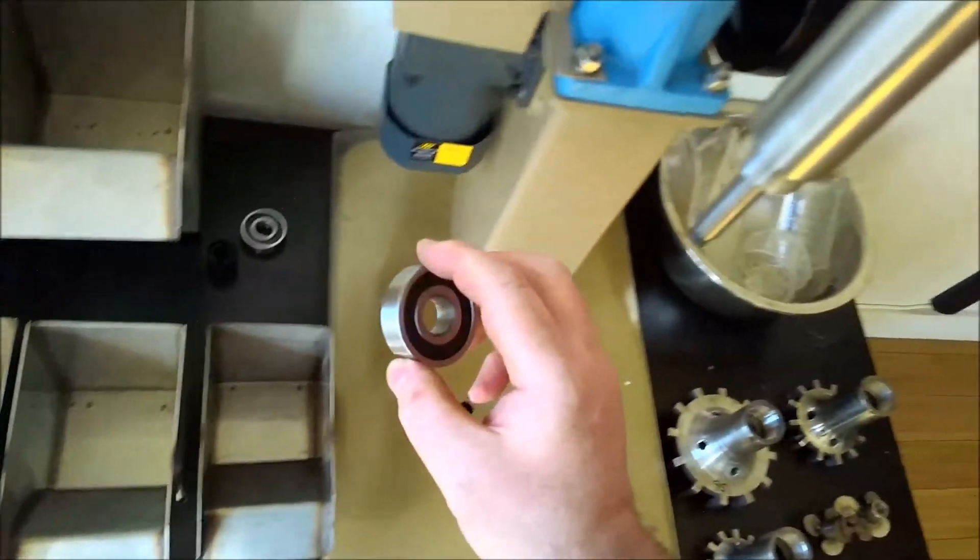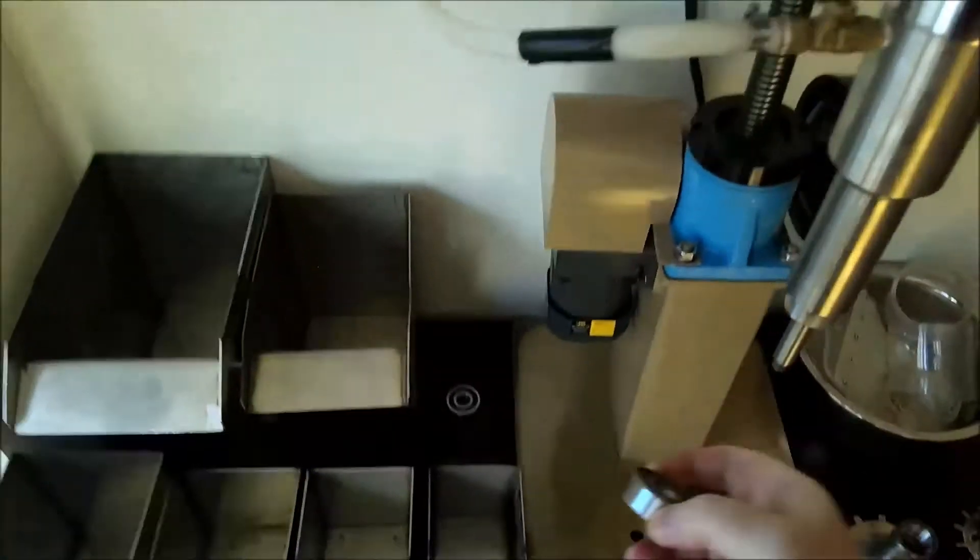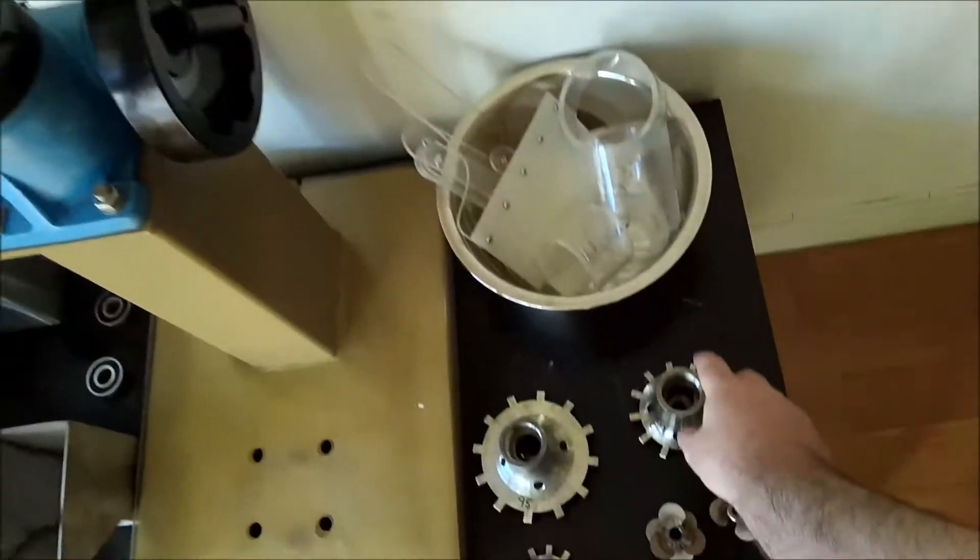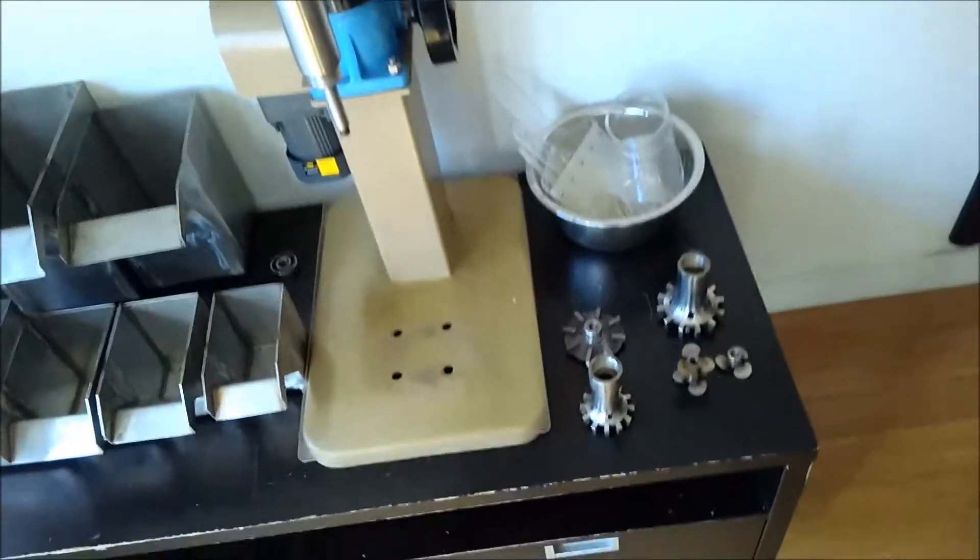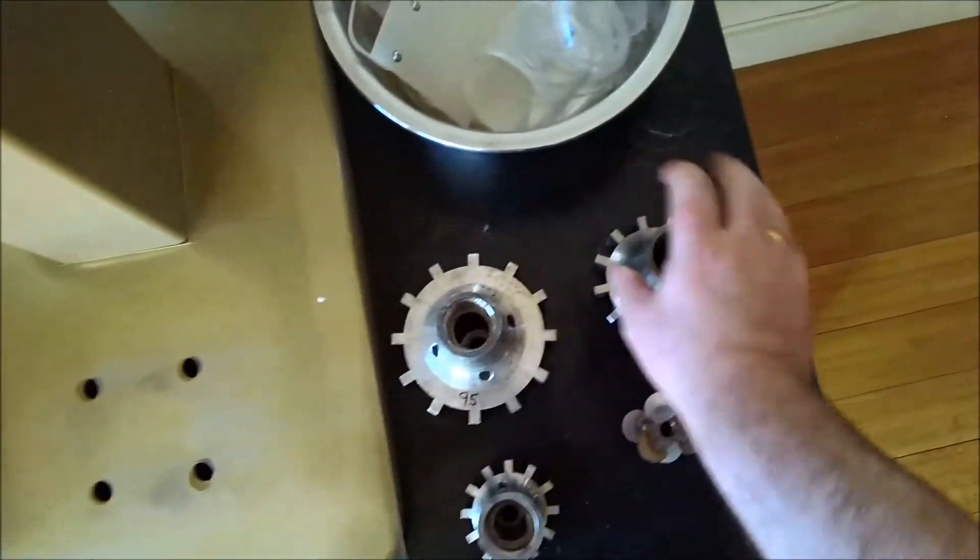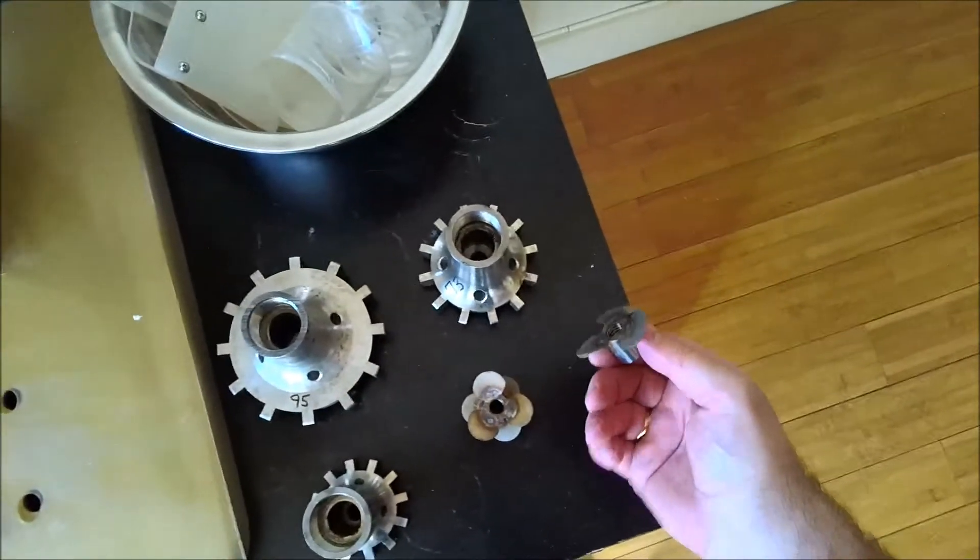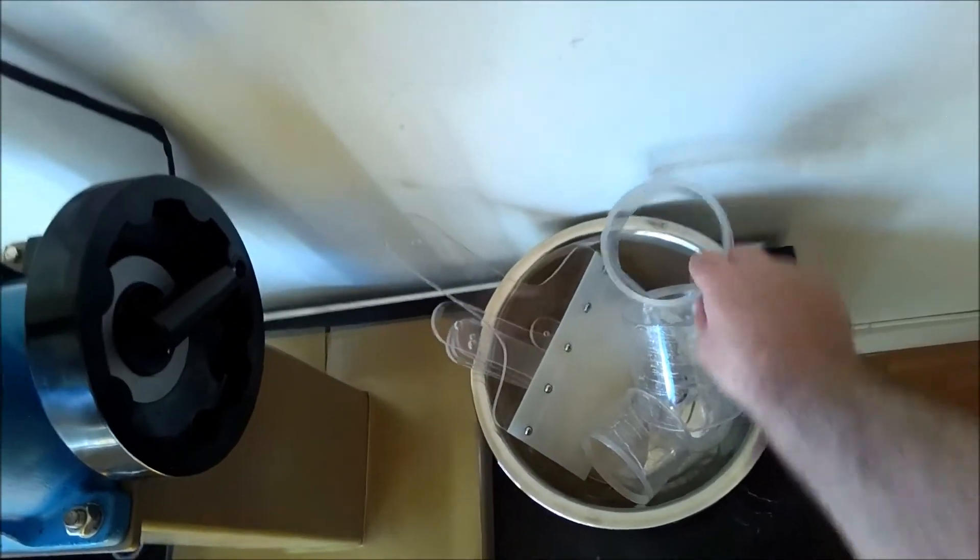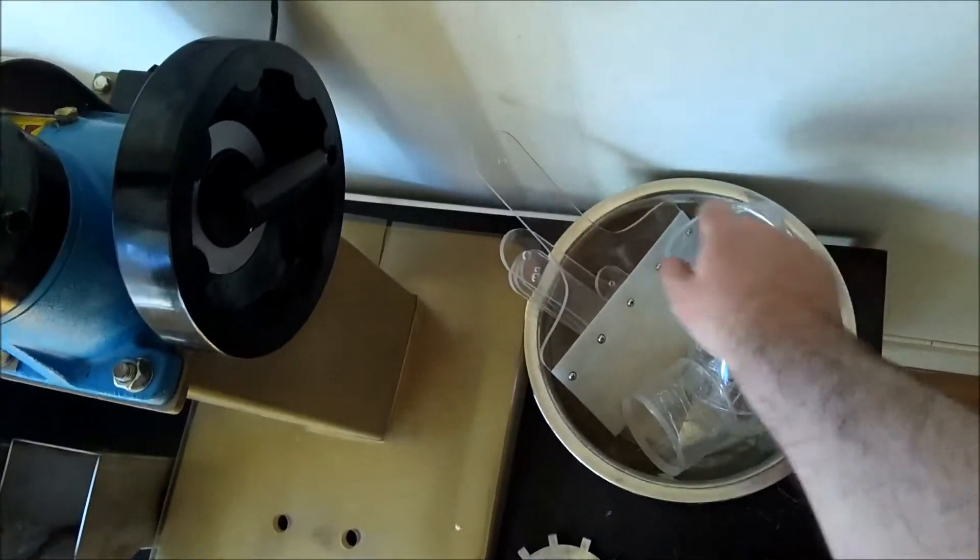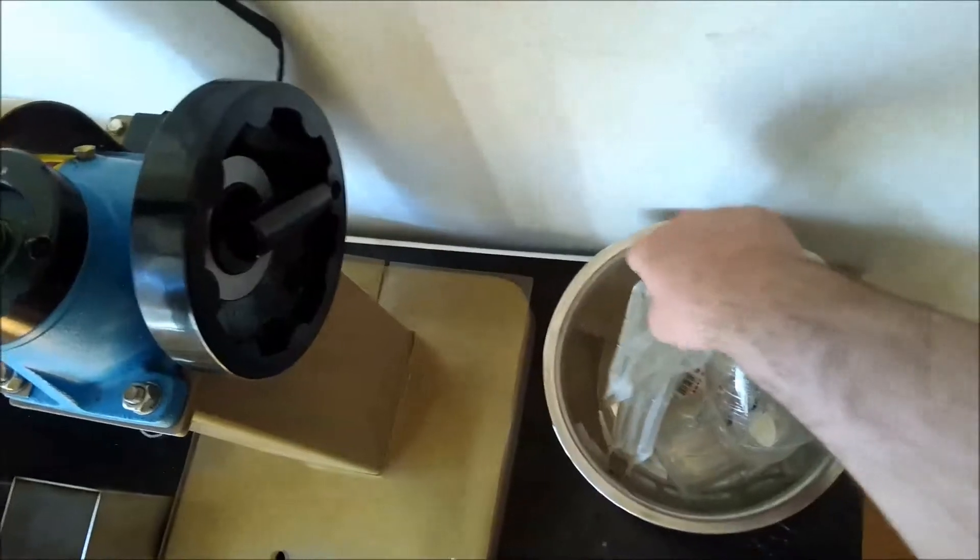It comes with two spare bearings and three oil seals. Three diffusers - the 4 inch, the 3 inch, the 2 inch, and the closed impeller associated with each. And it has the scrubber blades, the double. It also comes with the recirculating collars and a rainbow of froth petals.